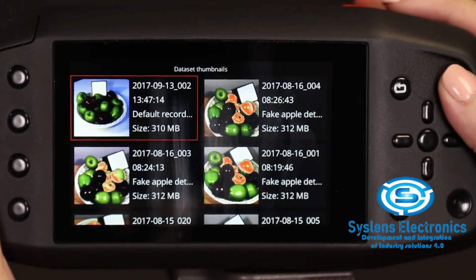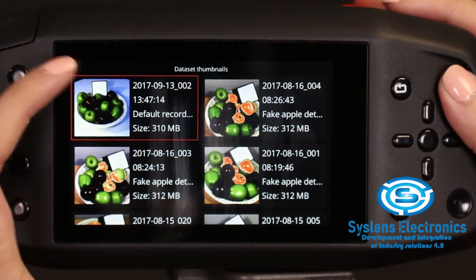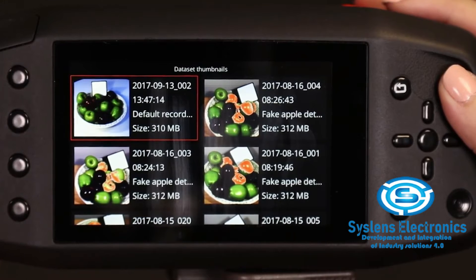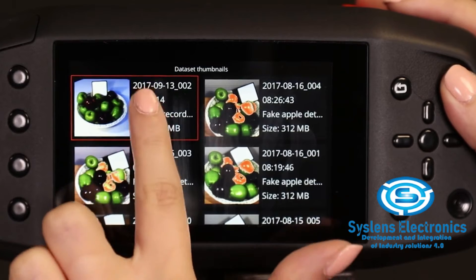The dataset name tells us directly the date when the data has been recorded, and the data recording mode that has been used. Let's select a dataset that we wish to examine further.